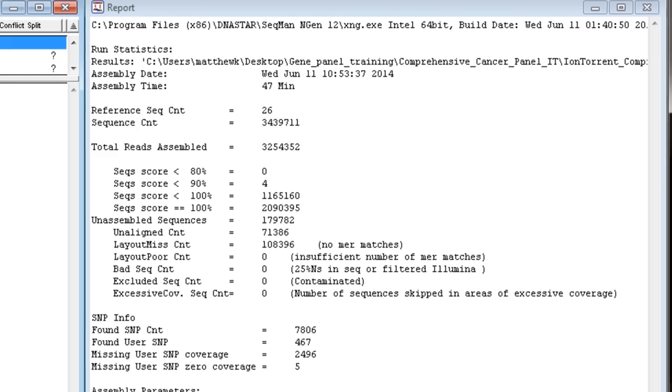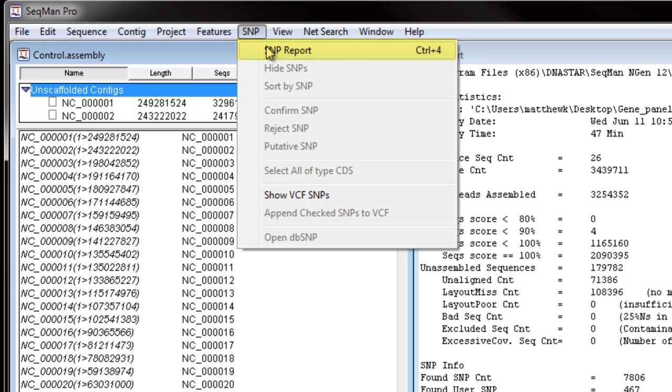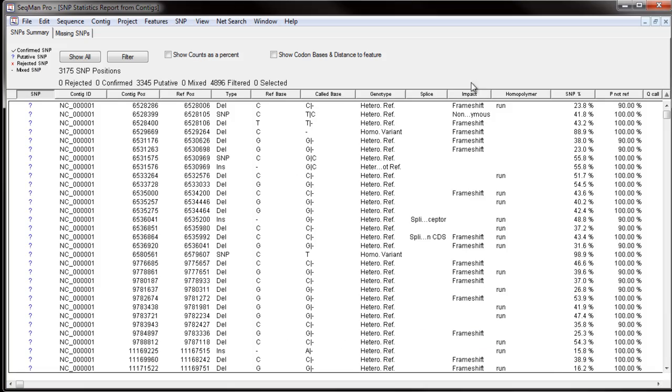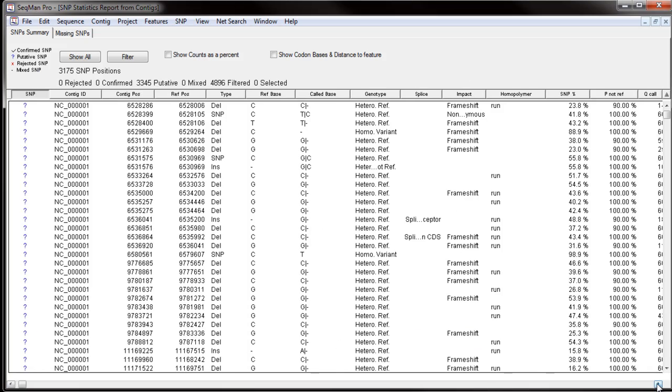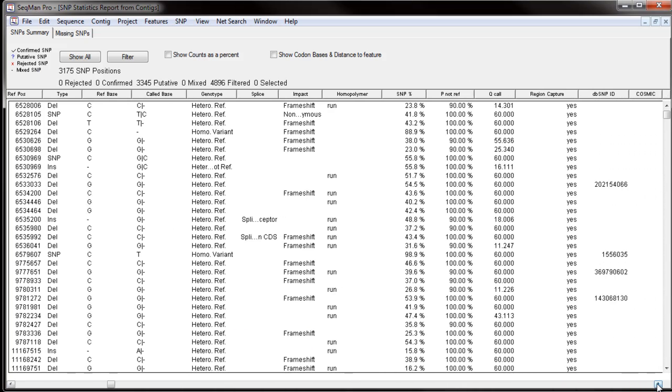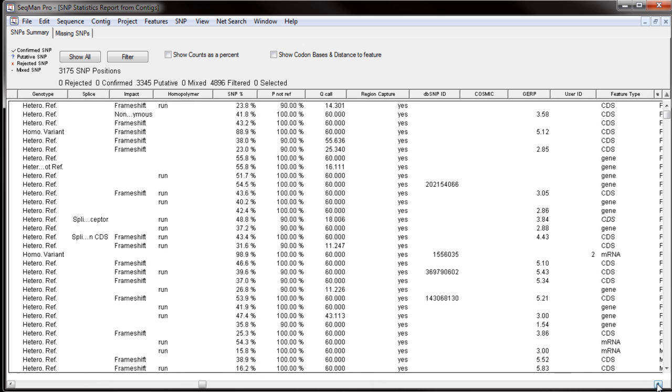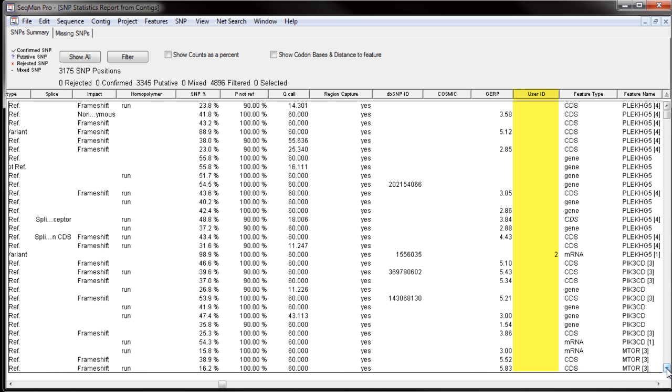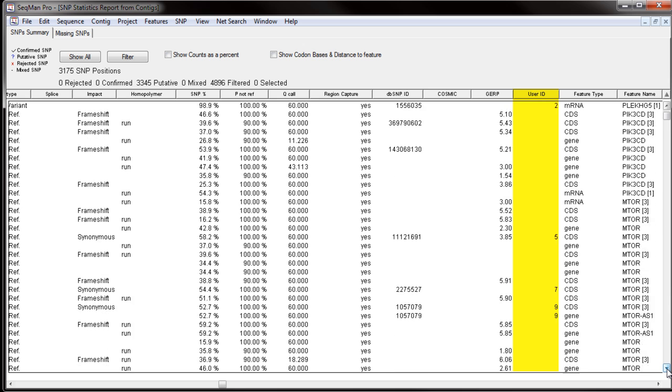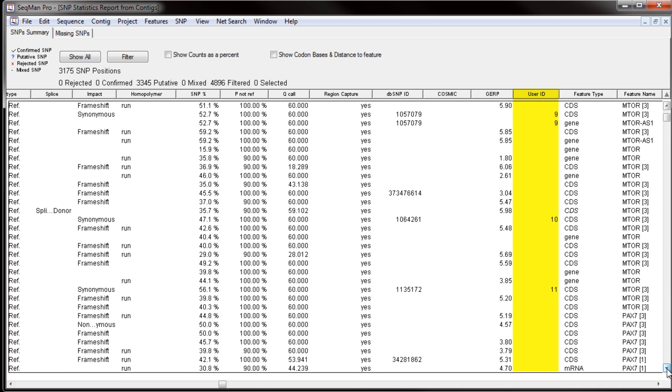We can look at these SNPs in more detail by opening the SNP report. If we scroll to the right in this report, we can see the user ID that has been assigned to SNPs in the VCF file. This ID corresponds to the numerical order of SNPs within the file.